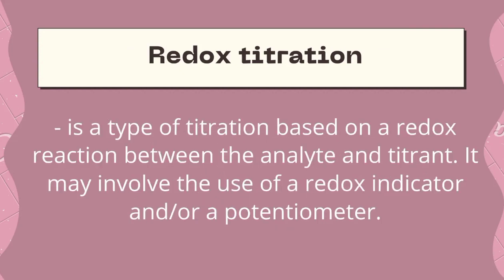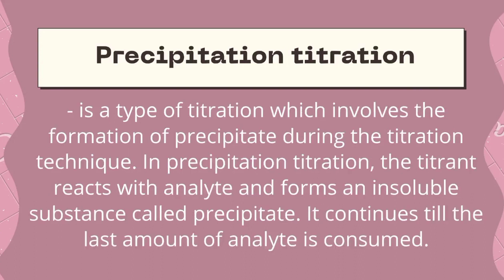The next is the redox titration, which is a type of titration based on a redox reaction between the analyte and titrant. It may involve the use of a redox indicator and/or a potentiometer.